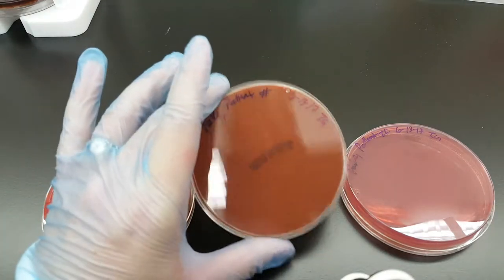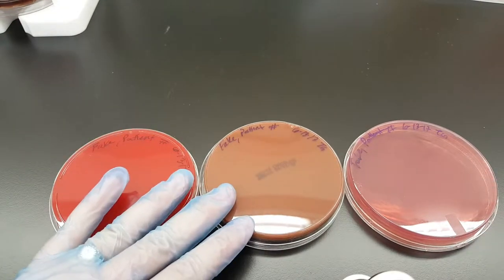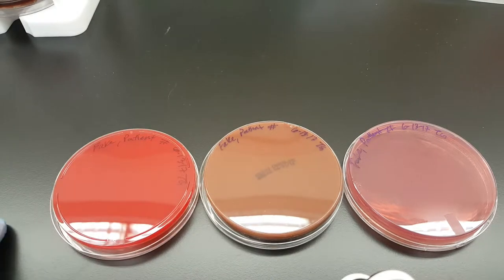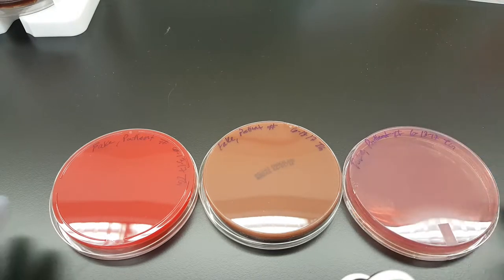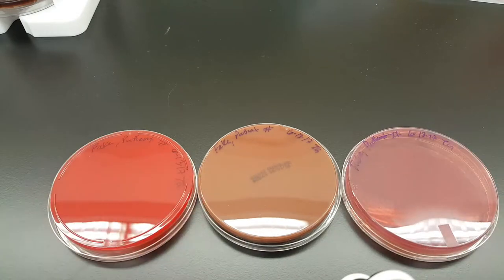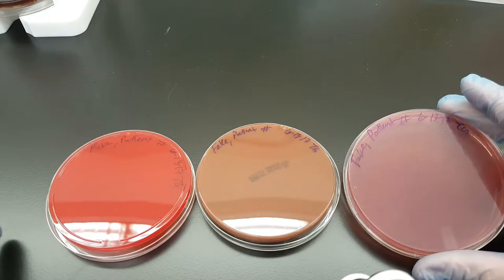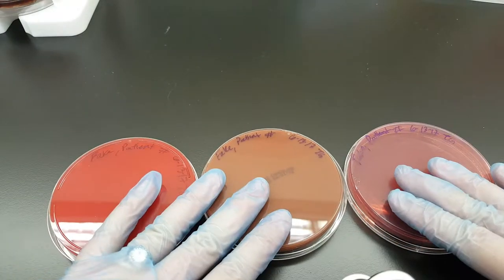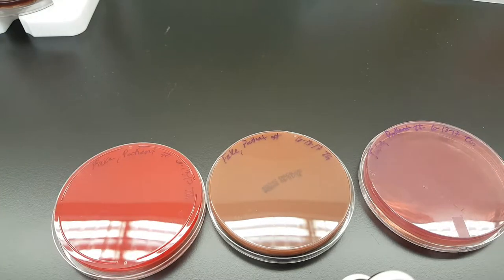The chocolate agar plate is for your fastidious organisms like Haemophilus. Neisseria likes to grow on it too — sometimes they can be a little finicky. And then the MacConkey agar is for gram-negative organisms. Basically, gram-negative rods really show up on here if they're fermenters of sugars, so we're thinking the Enterobacteriaceae family, which are fecal or normal flora.